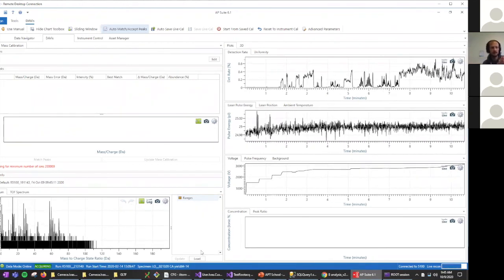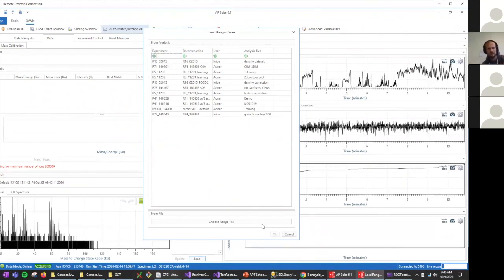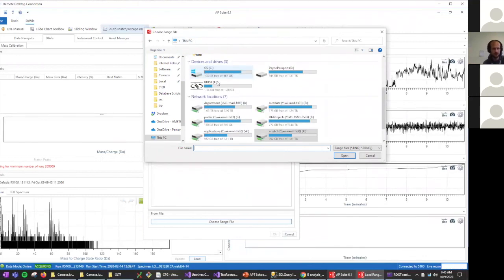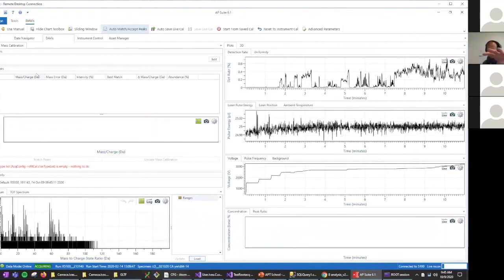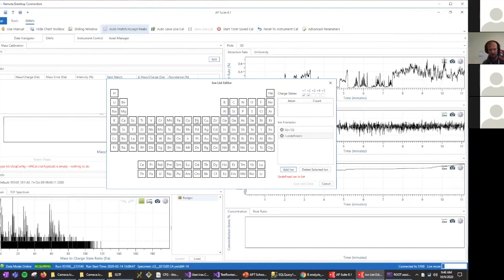I don't know what really is the way of going here, because as soon as this initiative that Peter sketched out takes off and people start parsing over thousands of data sets, it will happen that people start to ask questions about uncertainty. And that is one of the key issues that swirls around at the moment through the materials science community, in particular motivated by ab initio, but now also permeating whatever research initiative on data science and FAIR you ask.